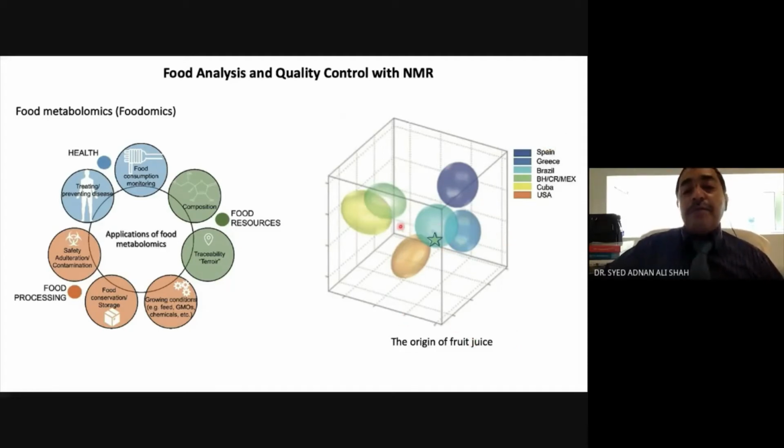They have different metabolomic profiles, different metabolites. Some metabolites can match, and others are not. So it can be used for metabolomic matching of samples with different origins, different parts of the world, or different types of origin. This spectroscopic technique can be used for this purpose.